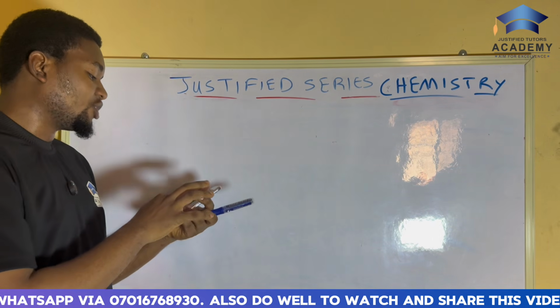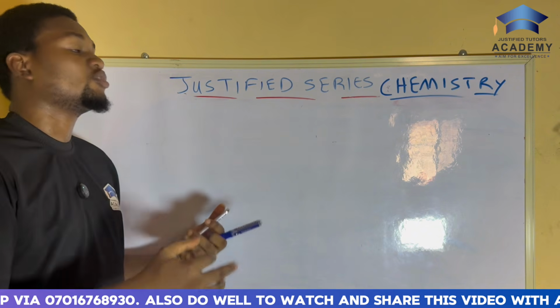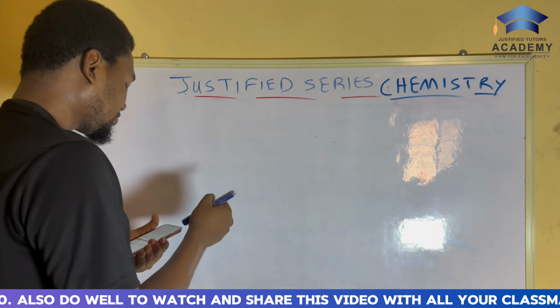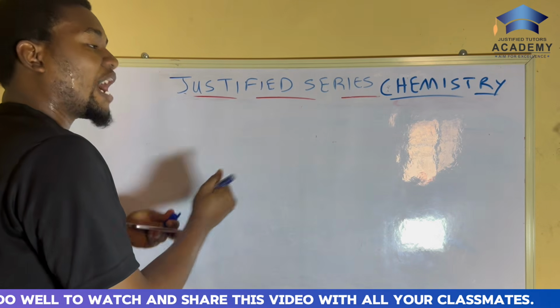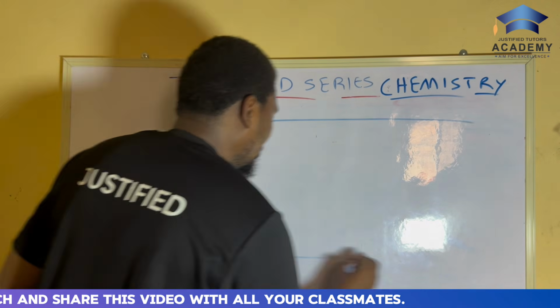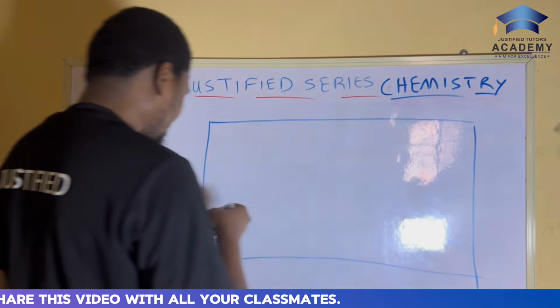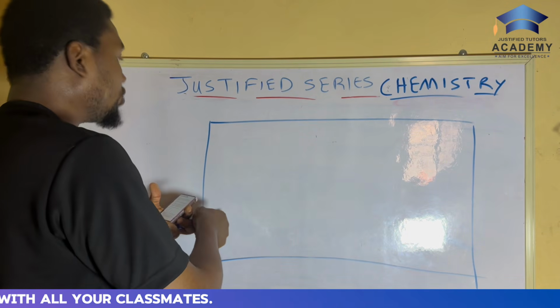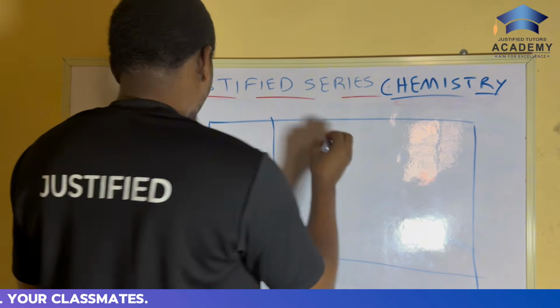Now, under titration, you'll be asked to carry out a practical. And during the practical, you'll be asked to document some things in this particular table. You'll be asked to write out some values.